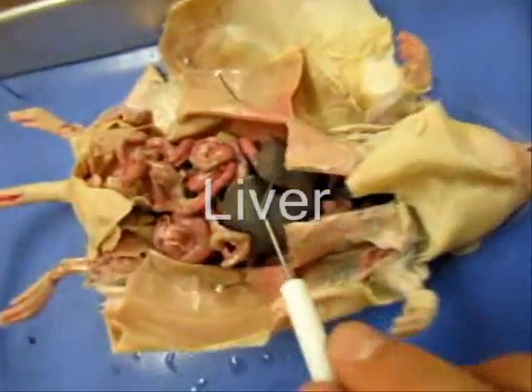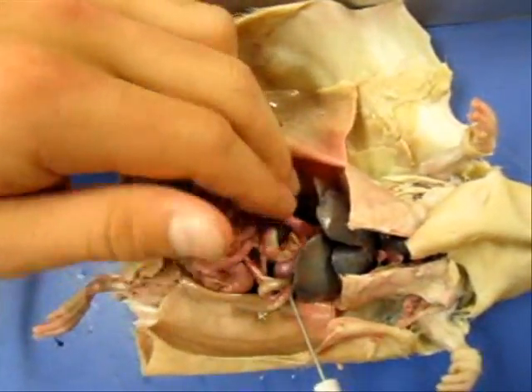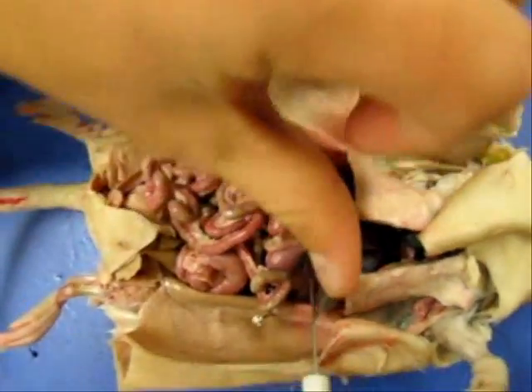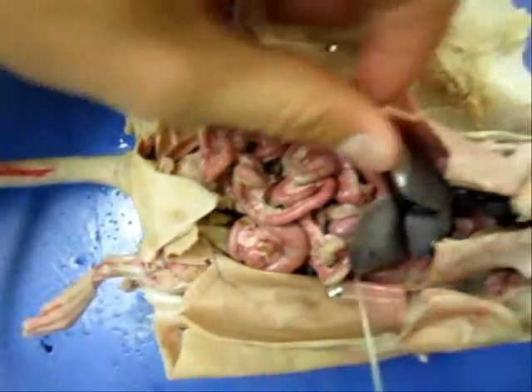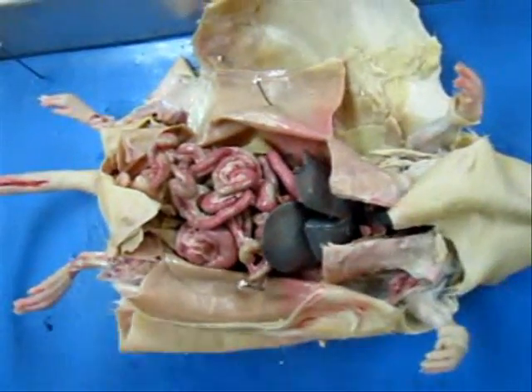Here's the liver. There's a lot of them. You can see there's 6. We actually took one out and cut it in half just to see, so there's not one in there. It should be right here. You can see that's attached, but there's 6. All these bluish colored organs, and they're caudal to the diaphragm.